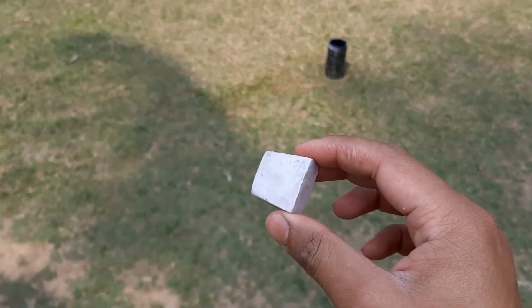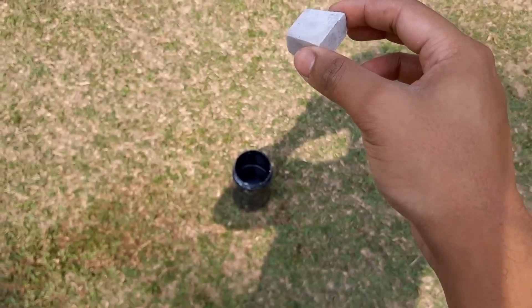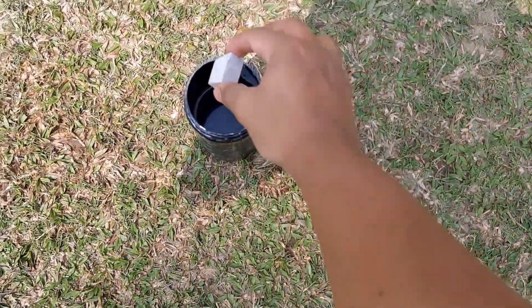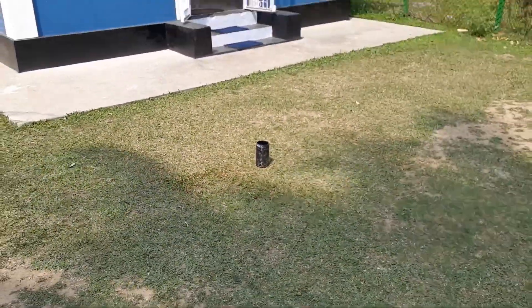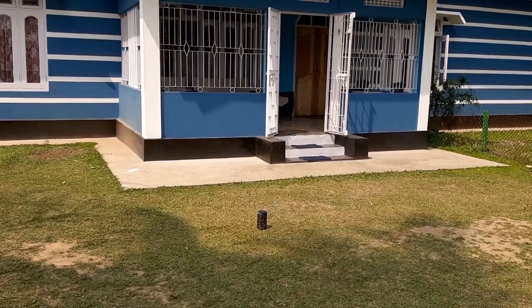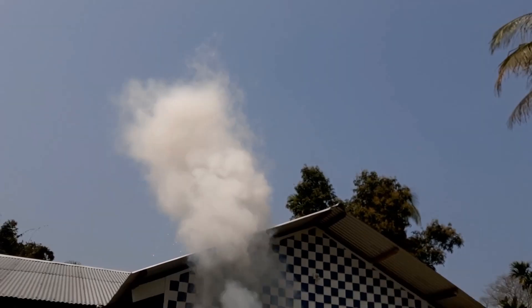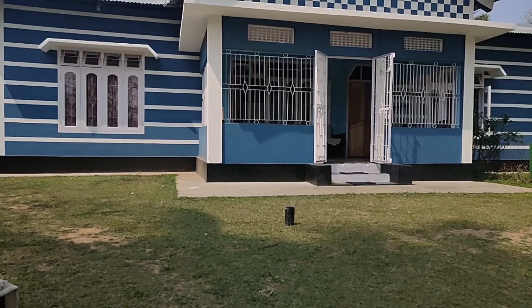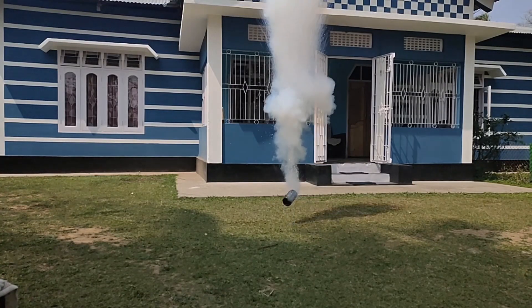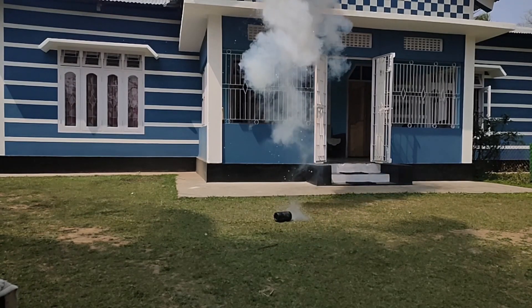I have this small cube of sodium metal with me. Now see what happens if I drop it into this vessel which is filled with water. That was cool, right?